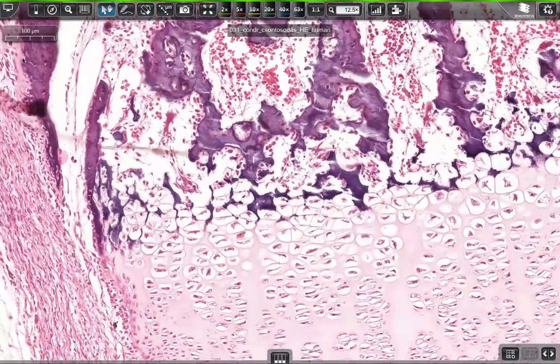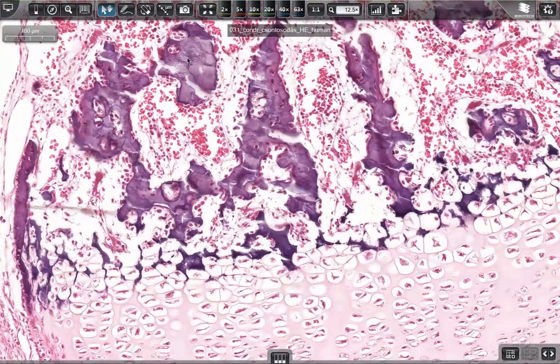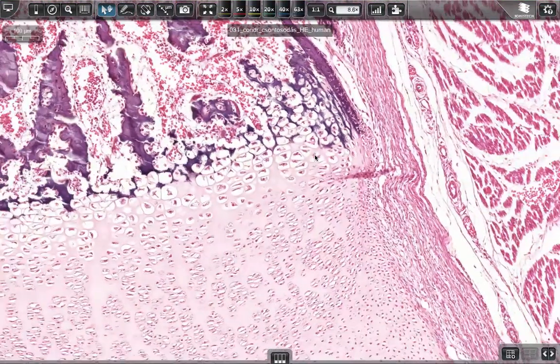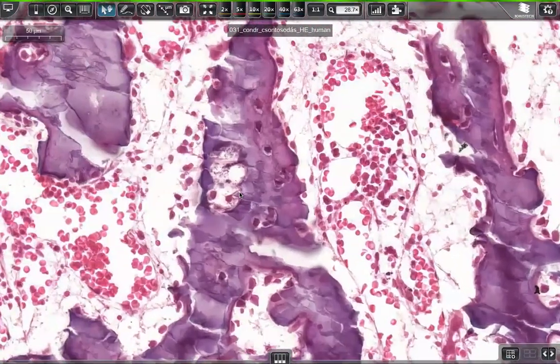And there, almost at the level of the edge of the bony collar, where the cartilage doesn't get any kind of vessel, the cartilage matrix breaks down. So here we have part of the degenerating cartilage. I can see they are dying cells. So look at that here as well. They're completely destroyed by the deprivation of gases. And when we just zoom in here, this area, this is the best area.